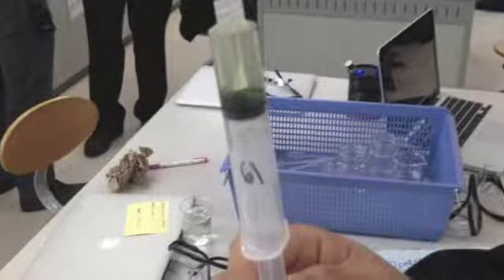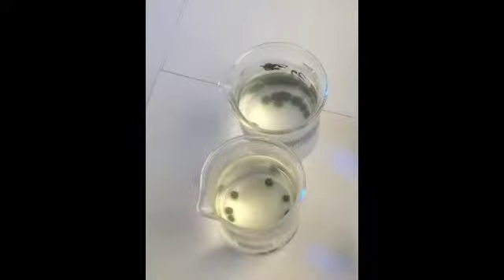One, two, three, 4, 5, 6, 7, 8, 9, 10. This shows how all the discs sank in both syringes. We poured the discs and the solution from the syringe into the appropriate clear plastic cup.